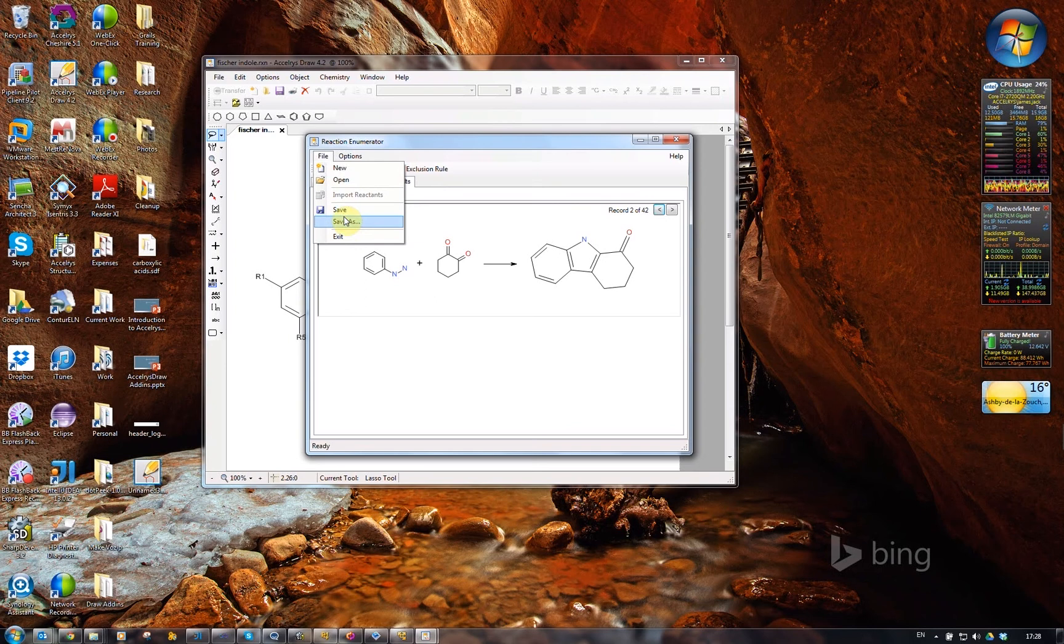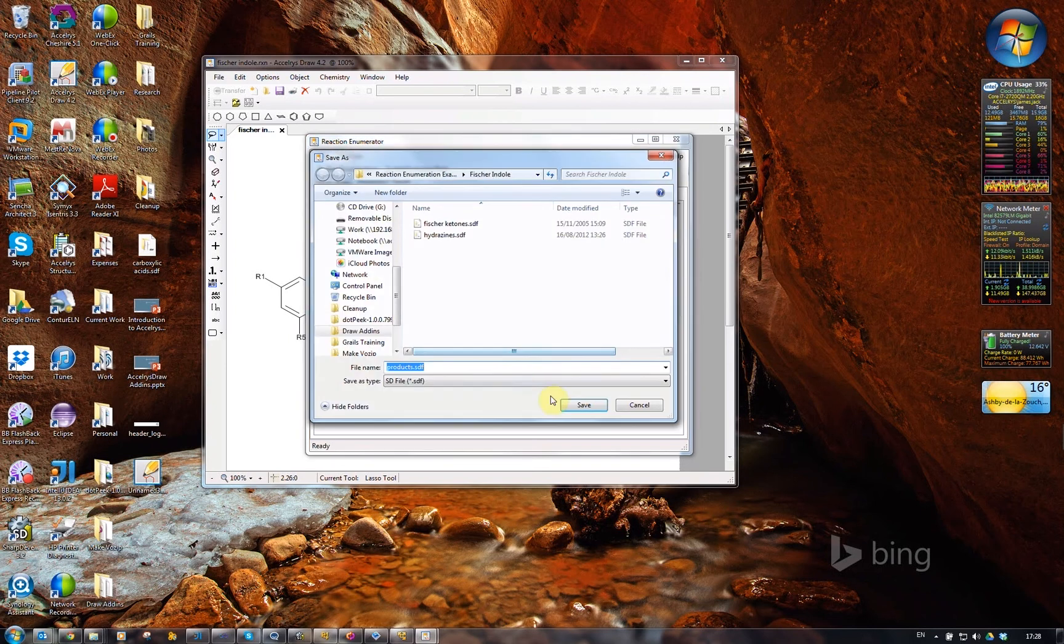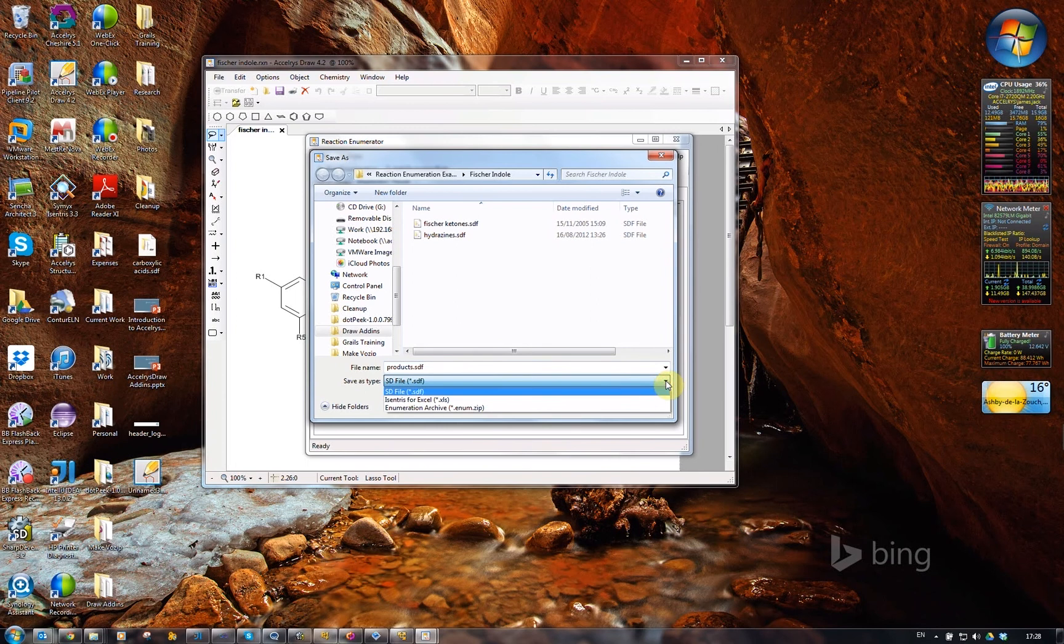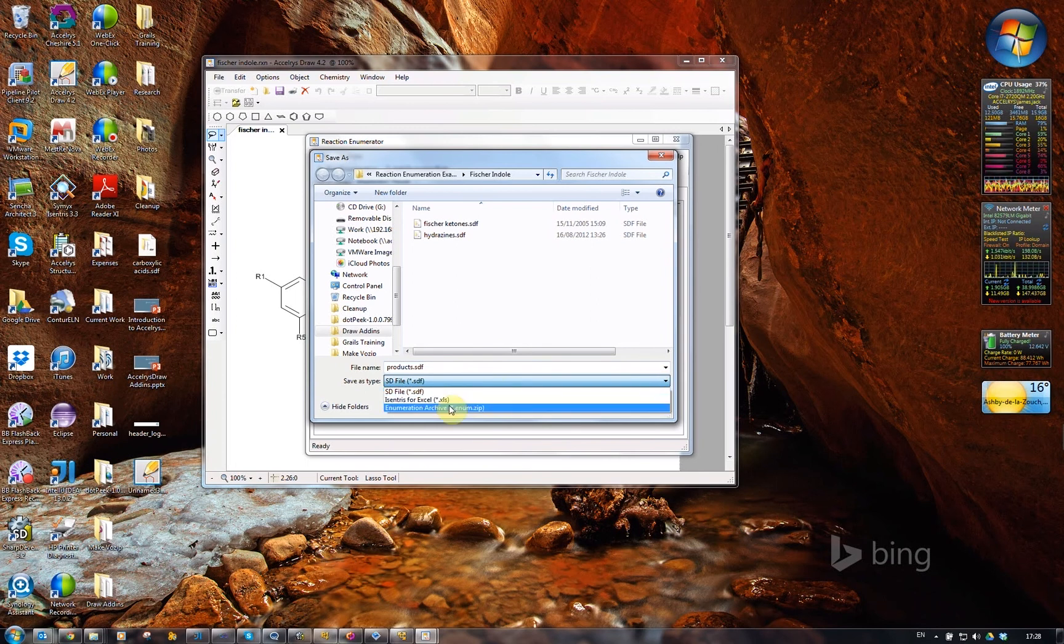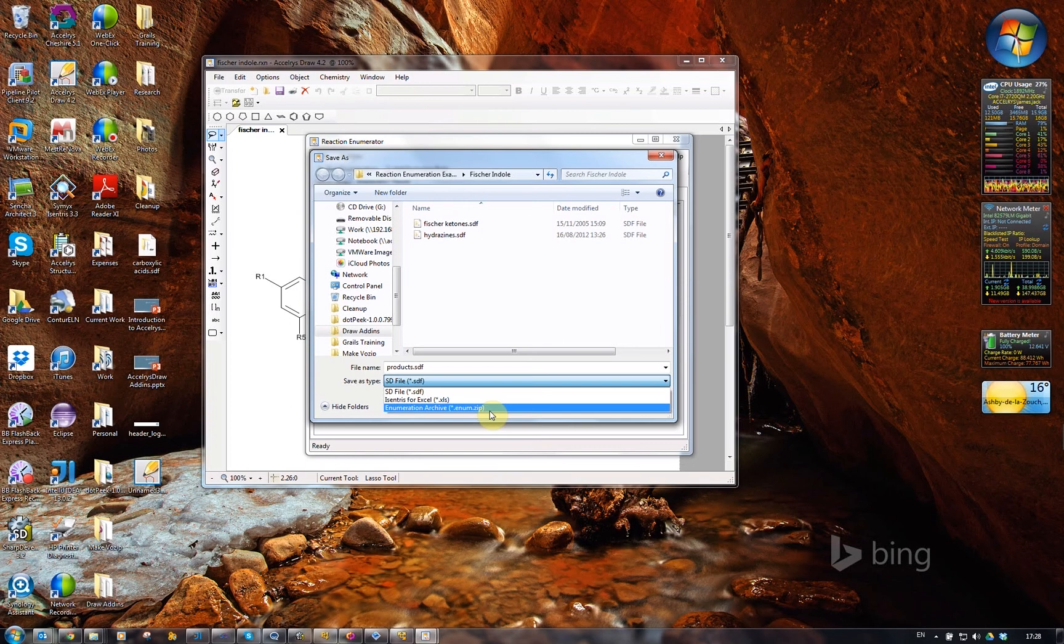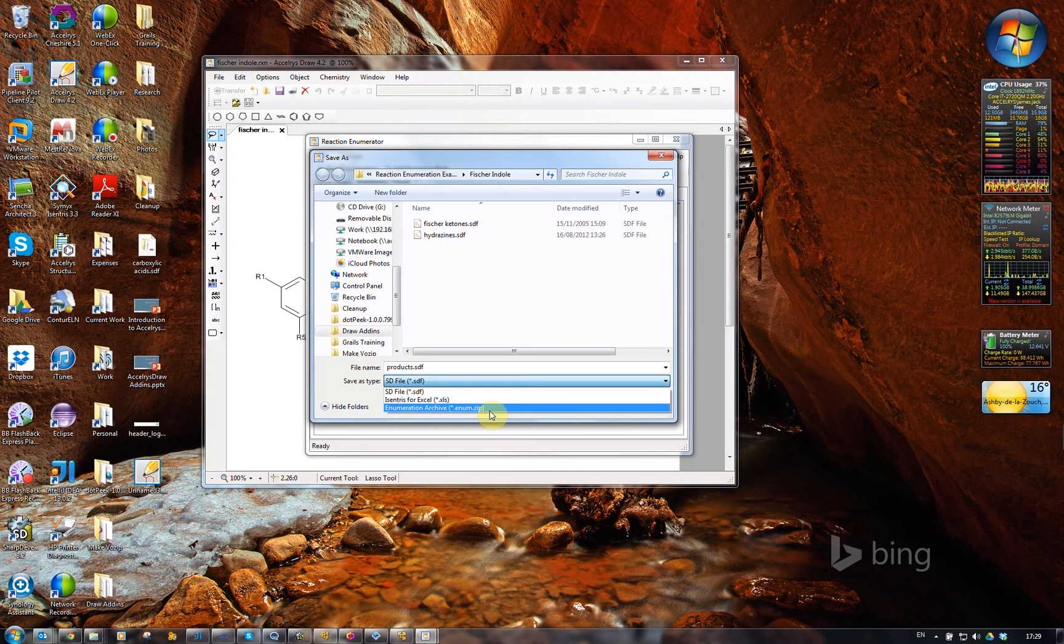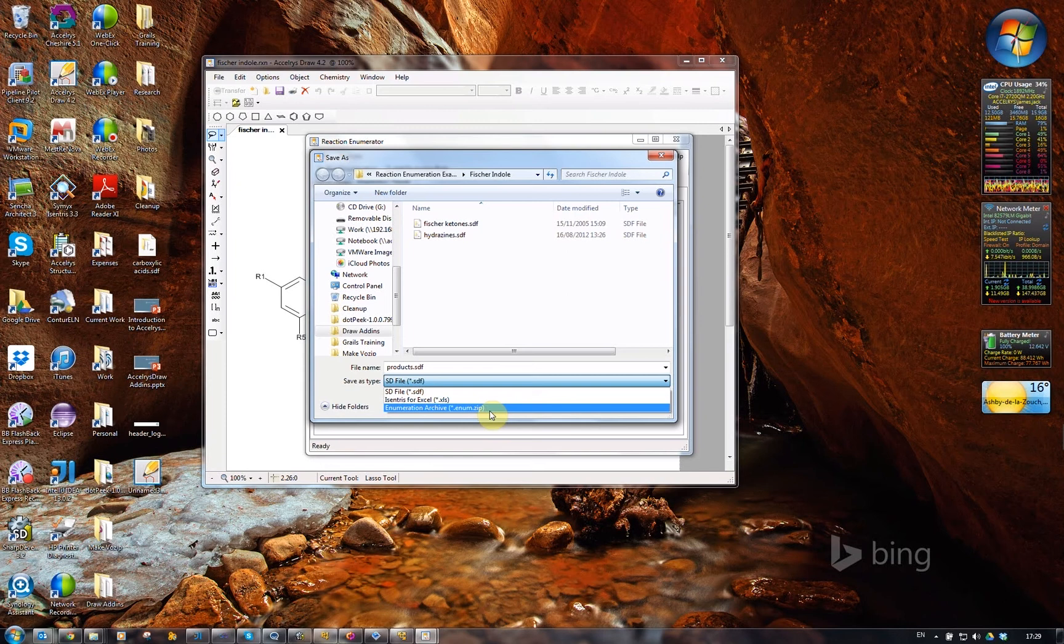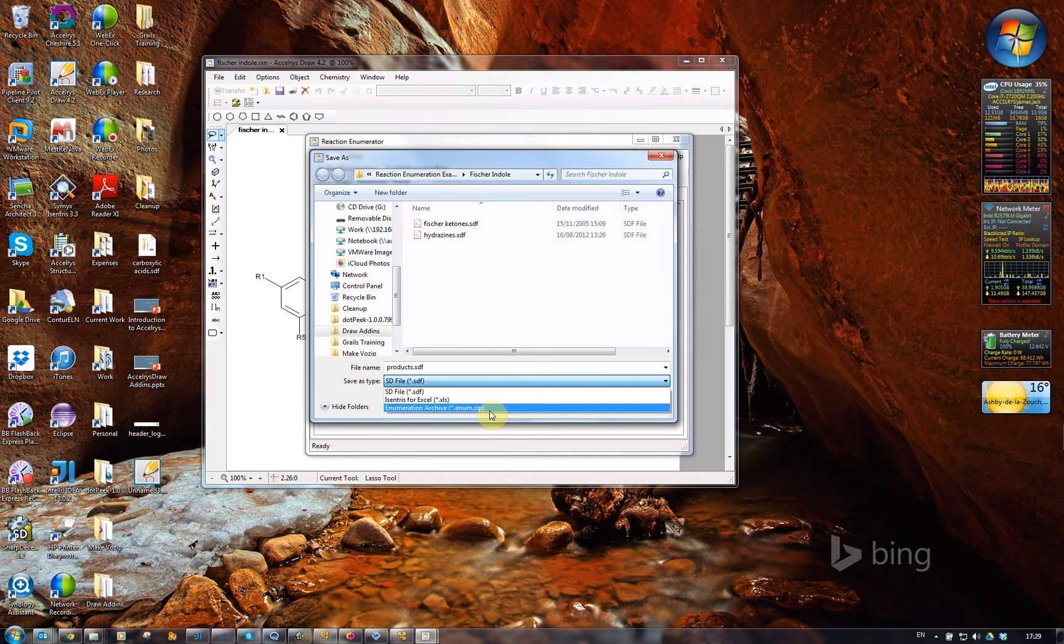I can save the results of the enumeration out to disk. I can either choose to export the products as an SDF, or I can create an ISIS for Excel sheet, or I can create an enumeration archive. The enumeration archive contains everything that I've used to create this enumeration, so it's got the reaction with the R groups, the SD files of reactants, and the enumerated reaction products.